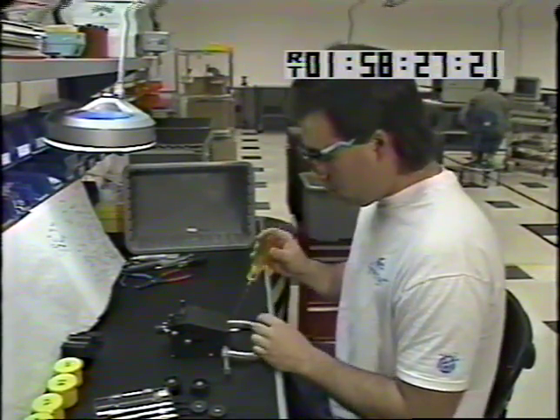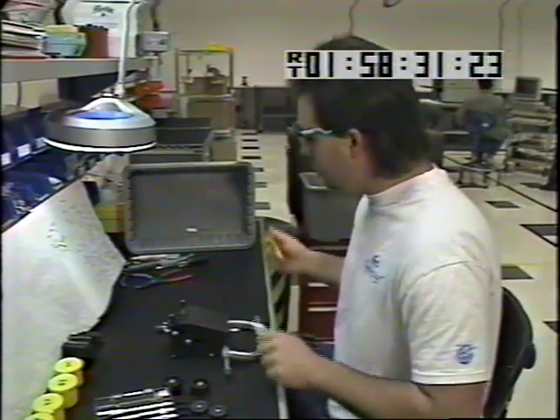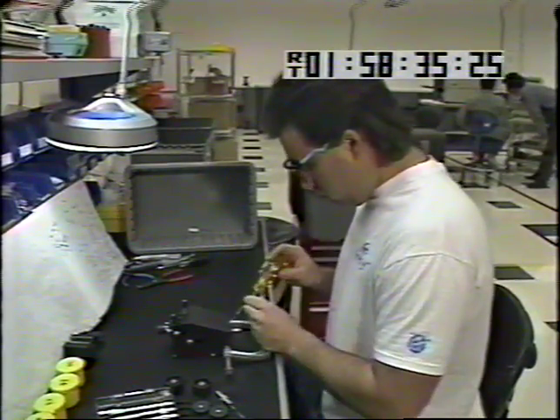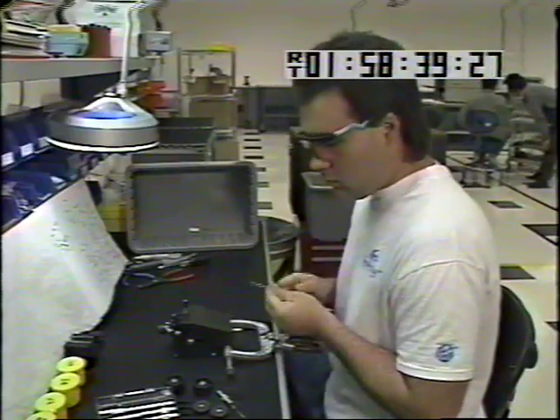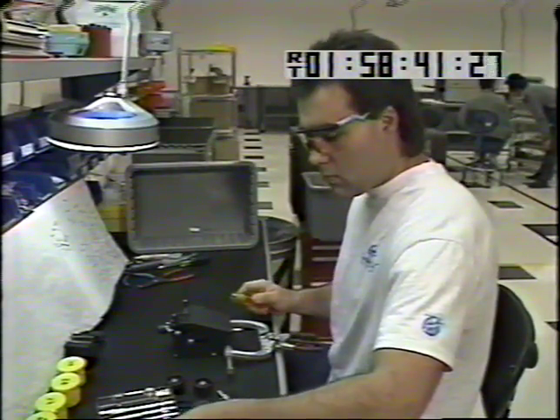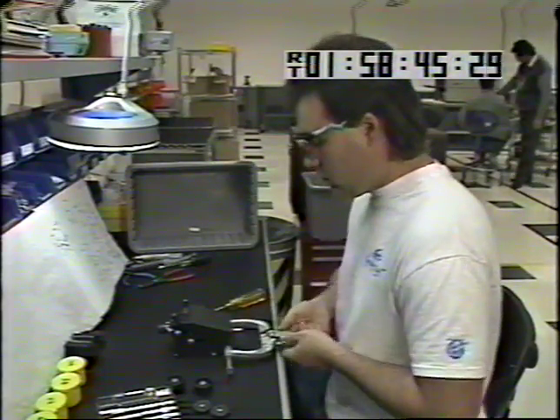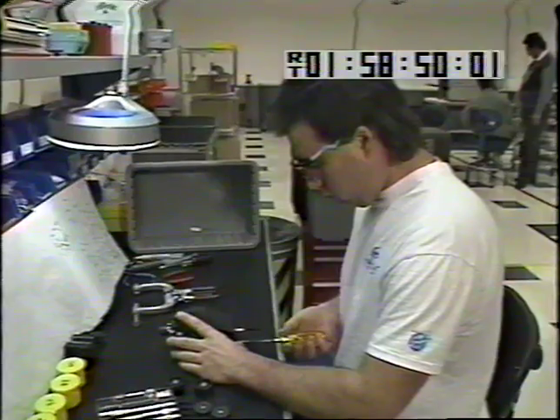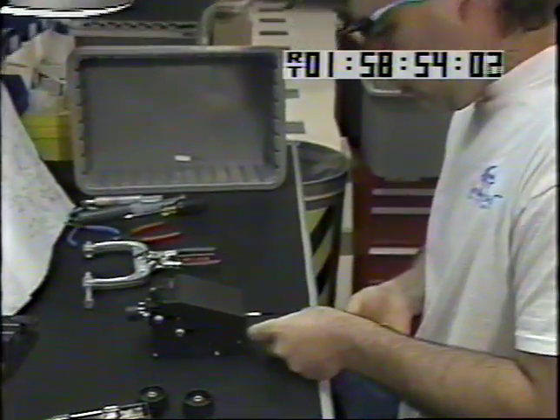We have now moved on to workstation 8, having moved past station 6, which is where we put on the beam focus assemblies onto the main casting. Our workstation 7 is the optics room, which we saw earlier in our process. It's just an operational numbering sequence that we've adopted for the control of the material in our manufacturing area.